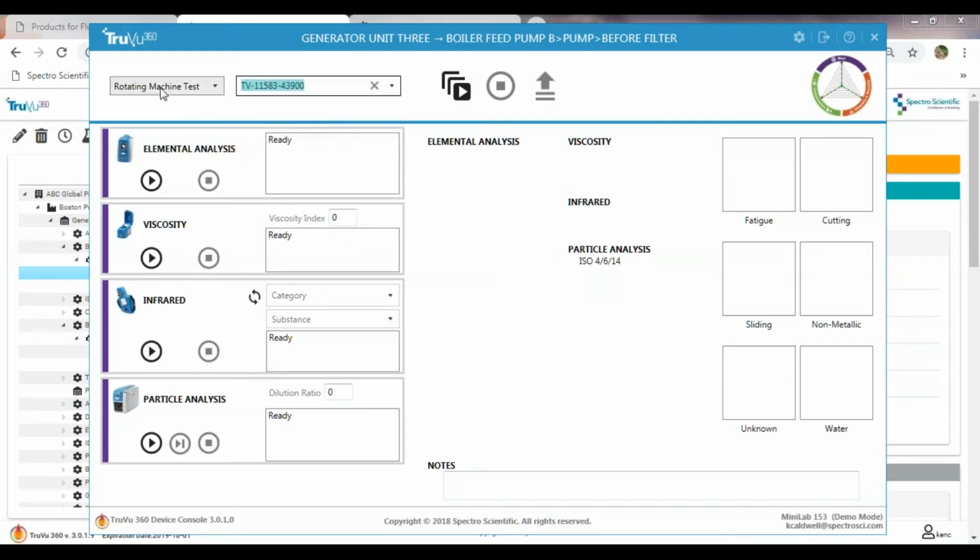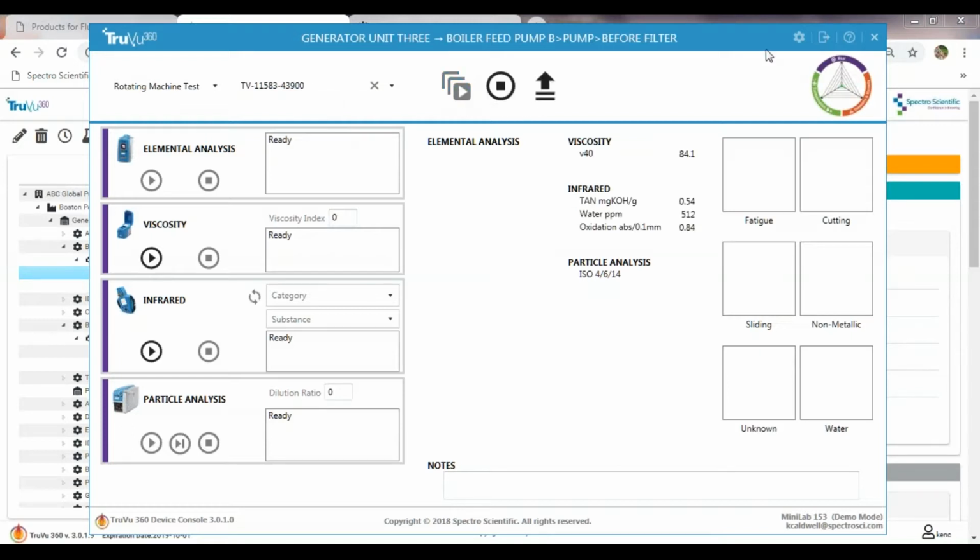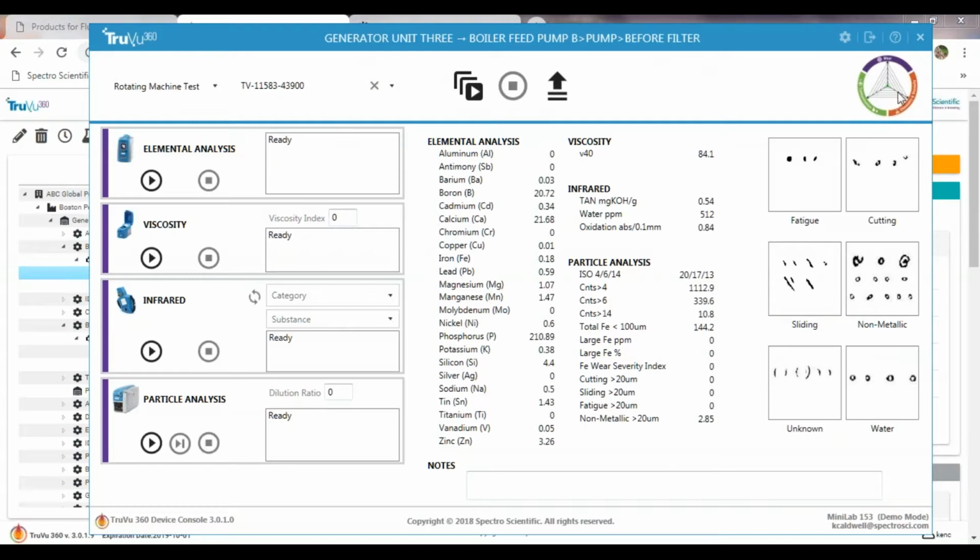So let's, again, just grab one of these, 900 here, and I'm just going to run it out. I'm going to point out the trivector here. There's nothing inside the colored circle. The colored circle means you're connected to the other software app, but we have some measurement results here. These are the data from the demo mode. If it all looks reasonable, what you then do is go upload.